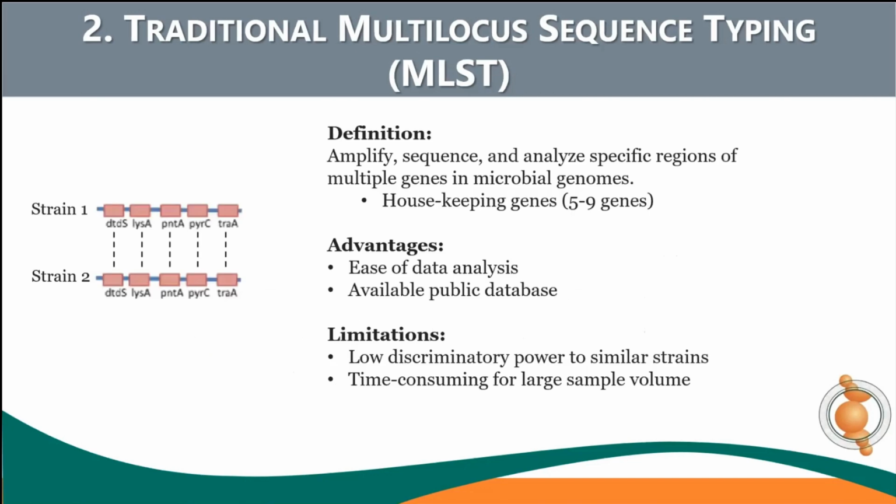By definition, traditional MLST is to amplify, sequence, and analyze specific regions of multiple genes in microbial genomes. More specifically, MLST is to sequence 5 to 9 housekeeping genes in multiple genomes from isolates, and to compare if any of these genes are the same or different.